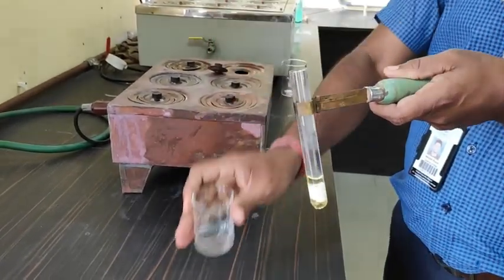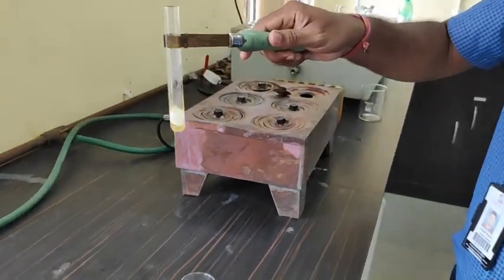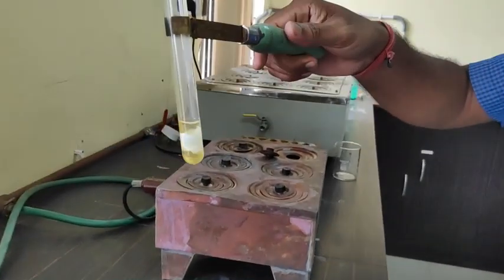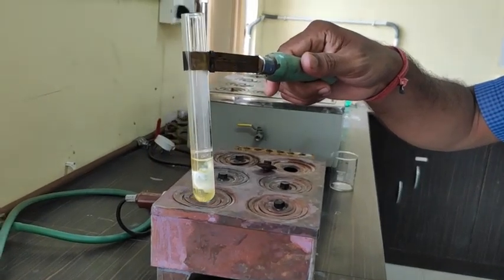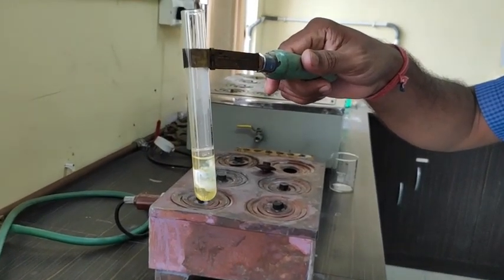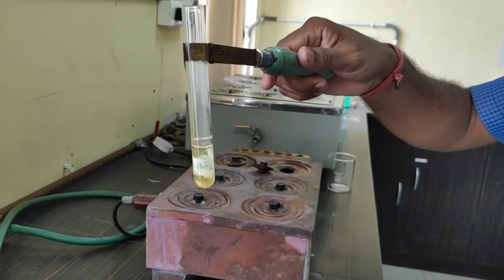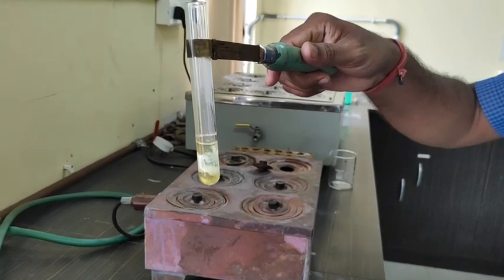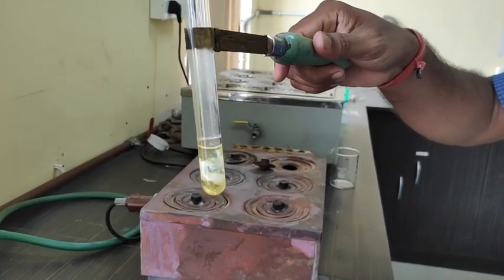What happens in this case? If we shake it properly, yes, we have the yellowish color which is required. Now of course this is a protein solution which we were using, and there will be some amount of aromatic group containing amino acid. So this is the result of the xanthoproteic test.